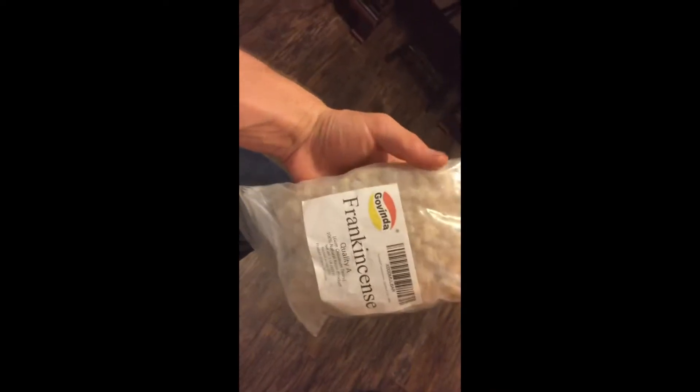After doing the mint essential oil, I had some ideas to improve the apparatus and I figured that I would use some of this frankincense which I had laying around to try to make frankincense oil.